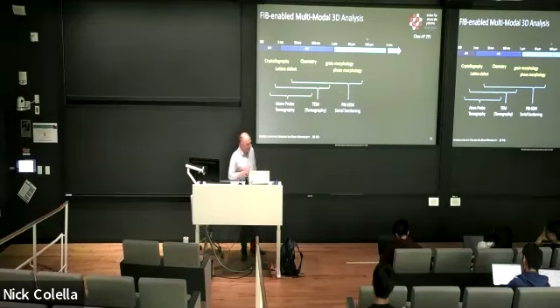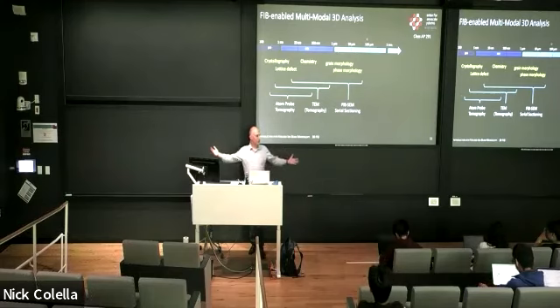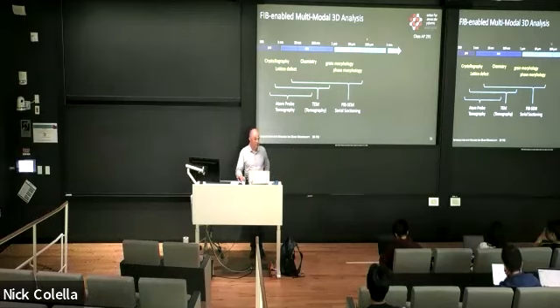One major development in the past, say, 10 years is that focused ion beam enables us to do 3D imaging on a large range of dimensions, right? So we have two external techniques.